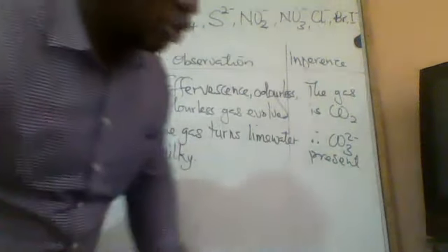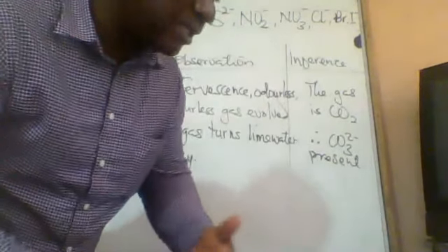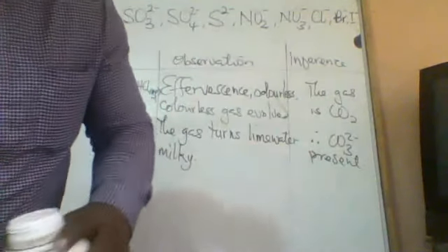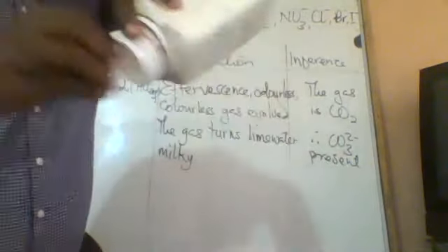And I hope you know effervescence. Effervescence is like when you open a mineral, as if it is boiling, sort of. Let me see whether I can show you.